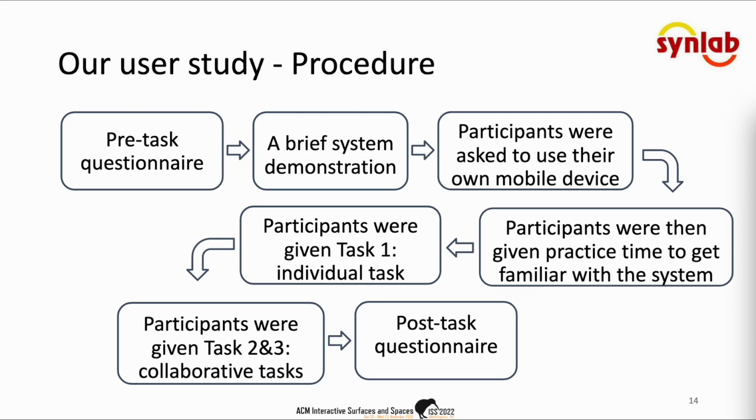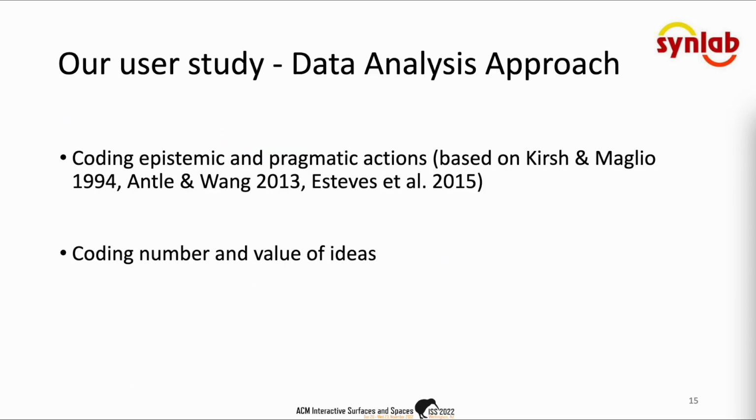After this, participants were given task 1 followed by tasks 2 and 3, with as much time as they needed to complete each task. Finally, participants completed a post-task questionnaire covering functionality, learnability, user experience, and usefulness of our design system.